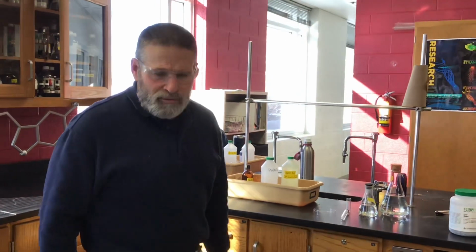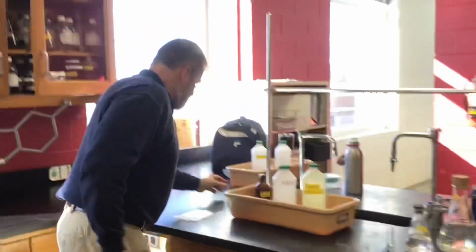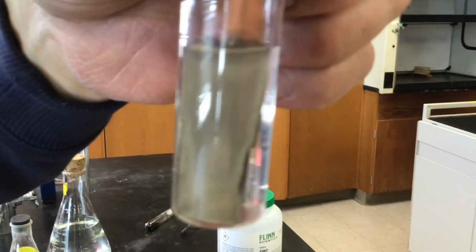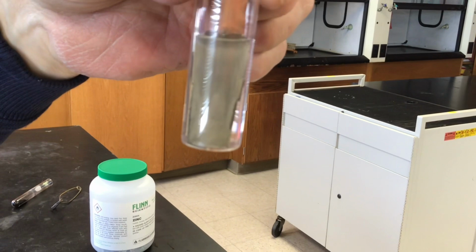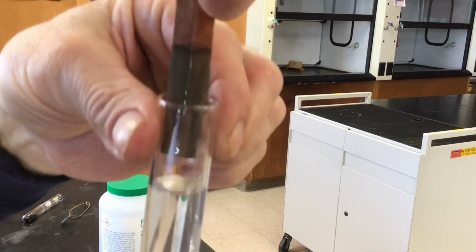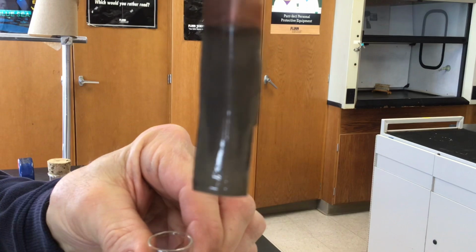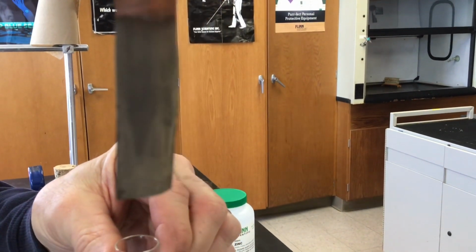Okay, we're back to number 4 now, finally. Let's check out that copper strip with the silver nitrate. And if you can see in there, the copper in the solution does not look nice and shiny anymore. And if I try to carefully take it out, yeah, so it has coated over with something.